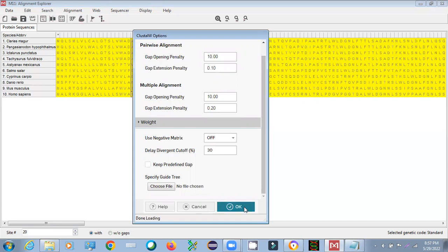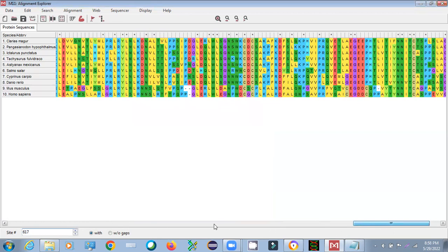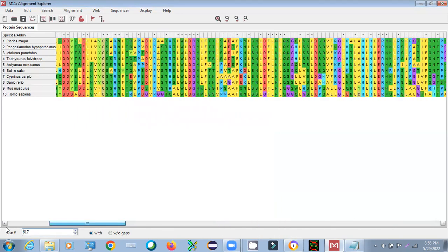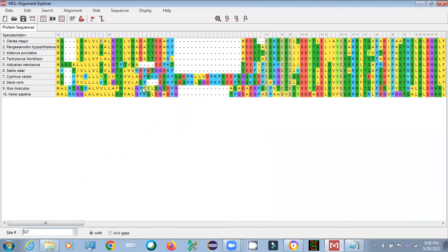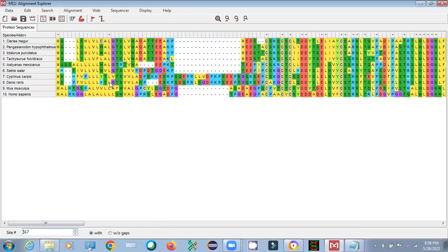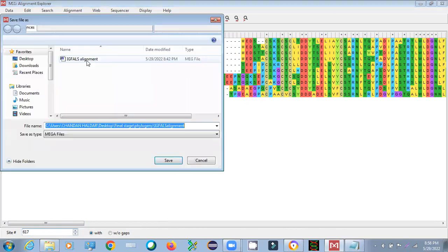Press OK to run the alignment. It will generate your alignment file, similar to what we saw in the previous video. You can see the alignment result — dashes represent gaps, and stars indicate highly conserved positions across all species. This alignment can also be done using BioEdit or MUSCLE. Now export this alignment file: go to Data, then Export, and save it in MEGA format, which is required for building the phylogenetic tree.